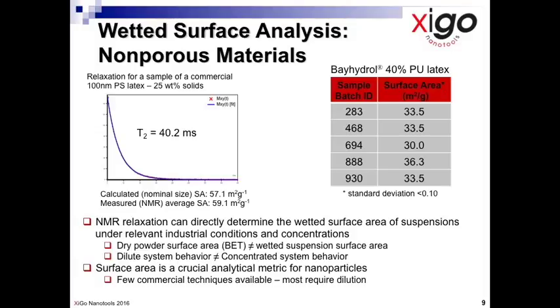This is especially true of nanoparticulate materials. In part 1, we discussed in detail why you need to measure suspensions as they are prepared and without dilution, because otherwise it is possible to obtain a value that is not truly representative of the concentrated suspension and so may not translate into a useful performance metric.